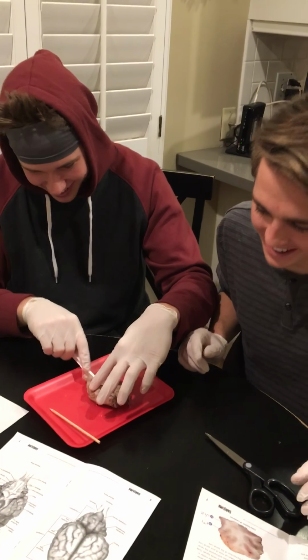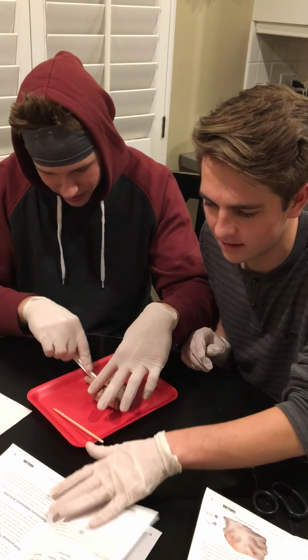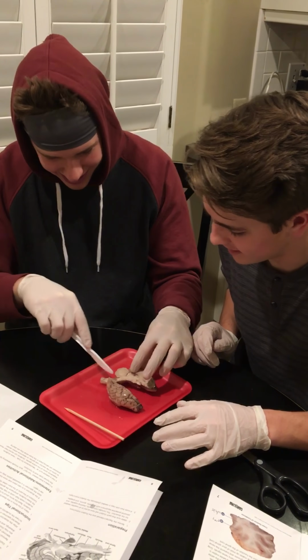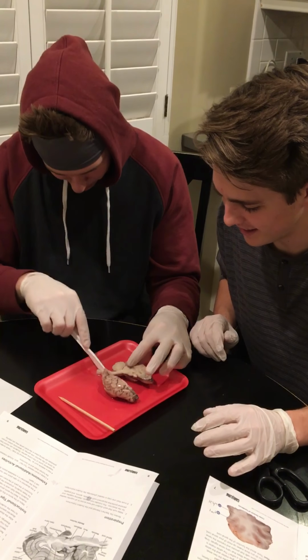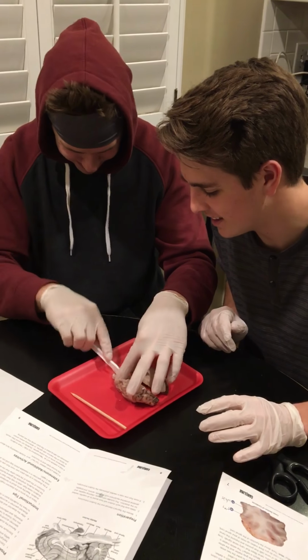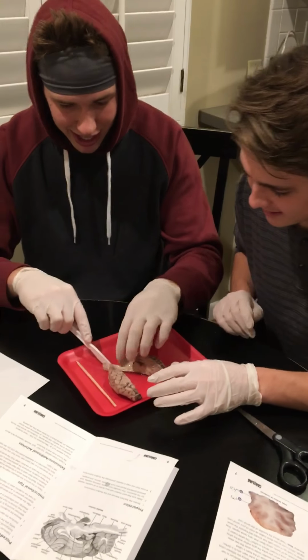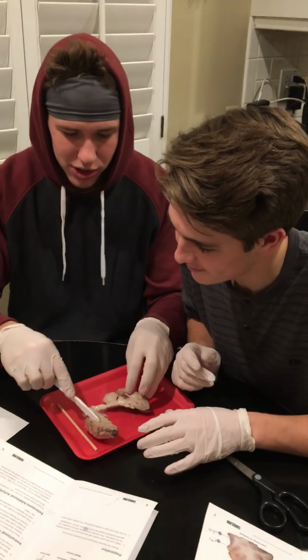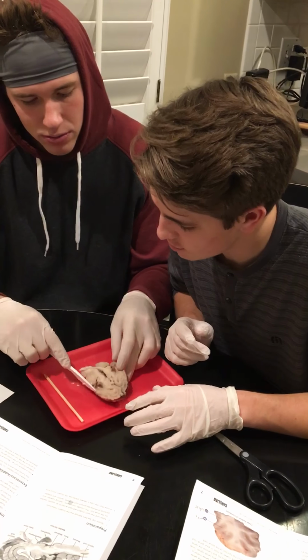No, that's not true. So we'll cut this right down the middle, just like some medium rare steak. It gets stuck on the back there, the brain stem. The brain stem's giving us a little trouble. Not the cleanest cut, but we'll get it open. The last thing we want to do is cut through this and get it leaking everywhere. Regardless, you get the picture. We'll split it open like that. Oh, there we go.